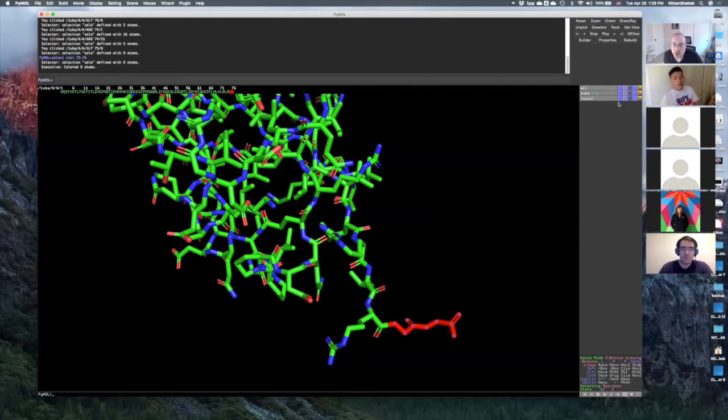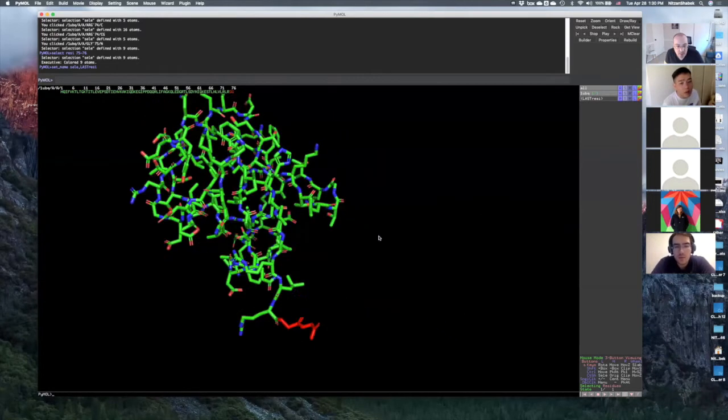Everyone were able to change the last amino acid into red? Okay. Now let's go to action and rename this selection. So you go to rename, and here there's another place open, and it's saying select. We can delete the select and just write, let's say, last residues. Okay? Or write GG or whatever. So now this is found here, and now we have that in the selection. Okay? So now we selected a certain amino acid. Okay?